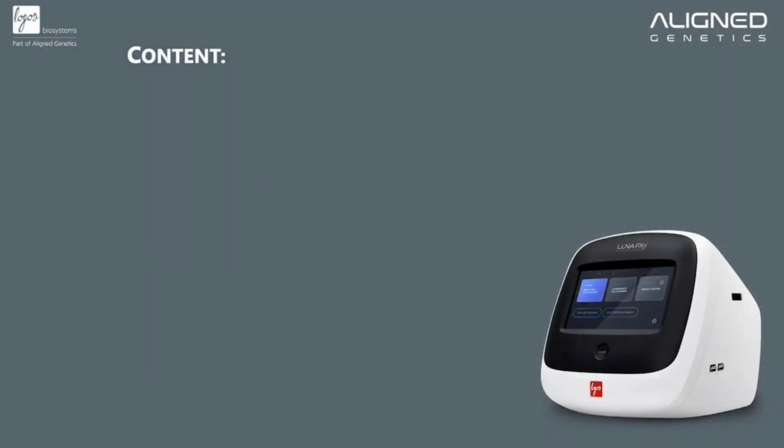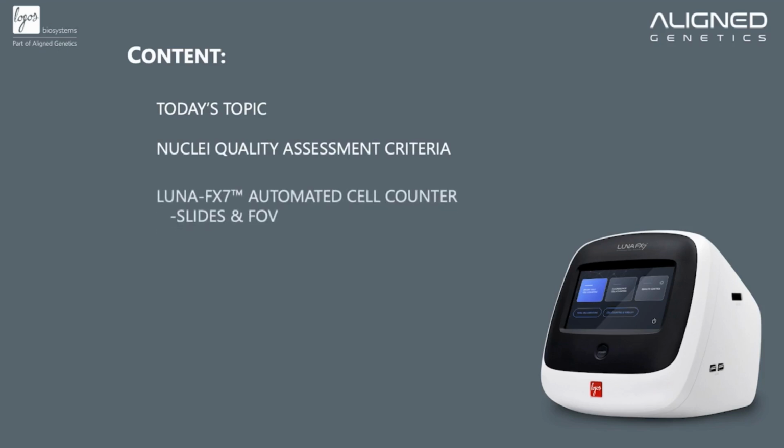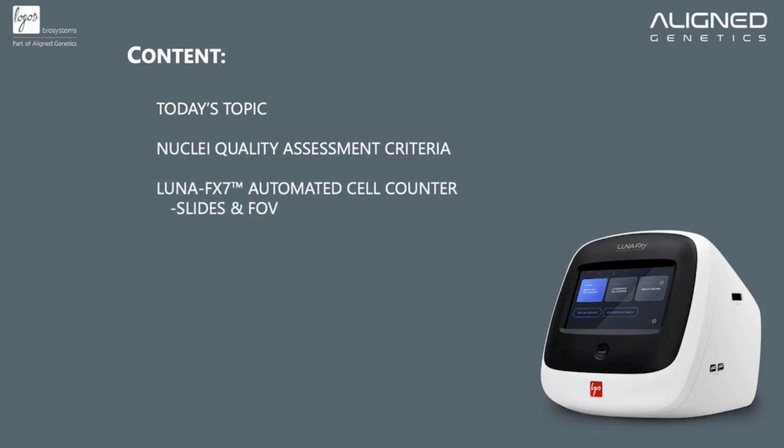All right, let's move on to today's content. First, we'll focus on today's topic. Next, we'll explore the criteria used to assess nuclei quality. And then we'll introduce the LUNA-FX7 automated cell counter. Following that, we'll walk through the step-by-step procedure for conducting nuclei quality assessment. And then we'll show you analyzed results obtained from nuclei quality assessments. And we'll address common troubleshooting scenarios encountered during nuclei quality assessment. Finally, we'll summarize today's presentation before moving on to the Q&A session.